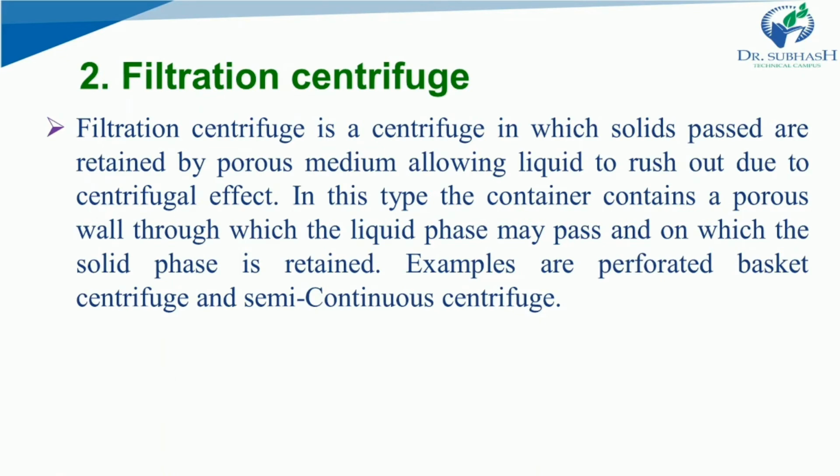Can you imagine any practical example which uses a filtration centrifuge? I'm not recommending any practical examples here, but this type of filtration you can easily compare to, for example, whenever somebody is filtering tea, right? This is this type of centrifuge. The only difference here is that it uses centrifugal force or centrifugal effect to separate.